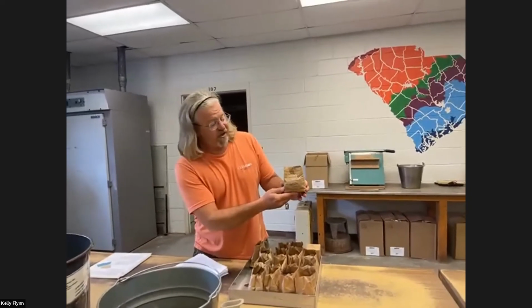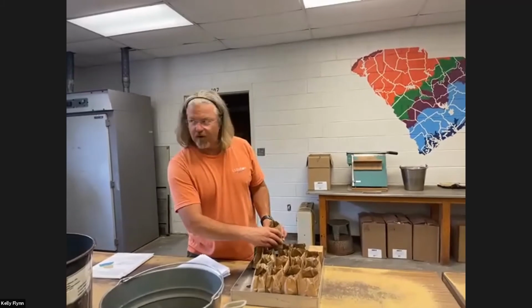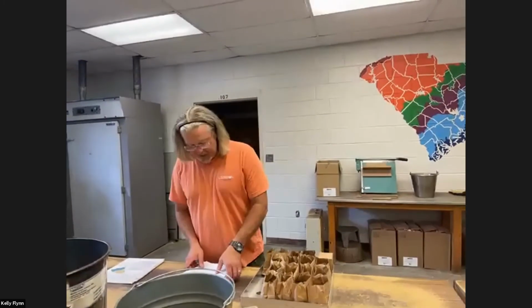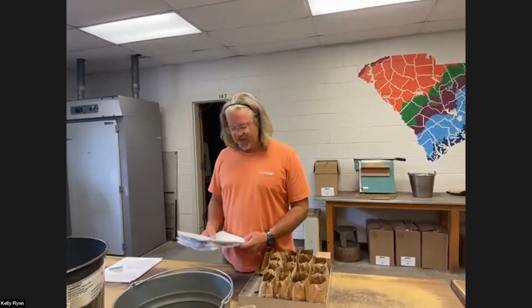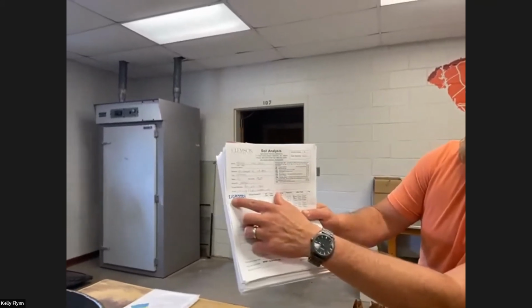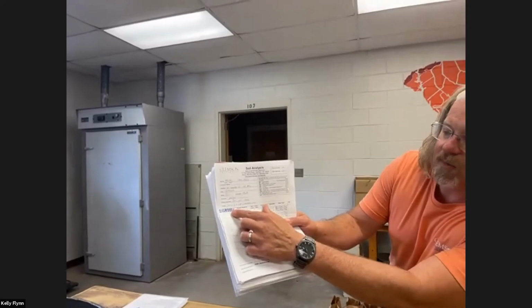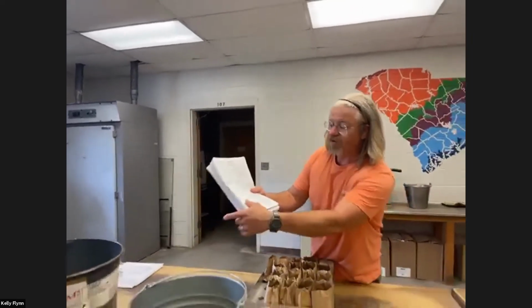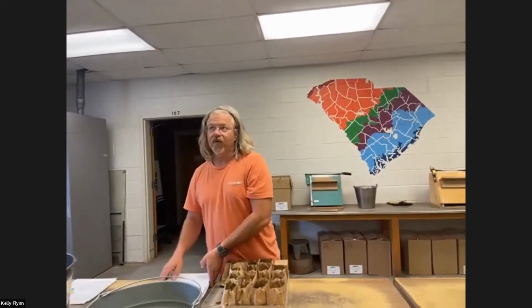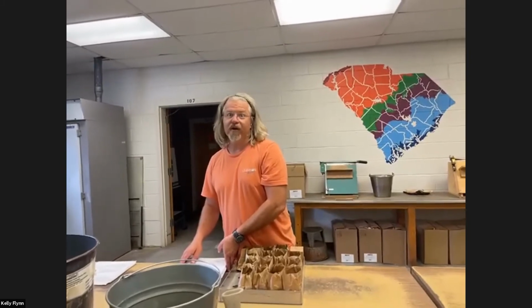There's a fill line right here. If you guys are ever taking soil samples, there's instructions on the back of the bag, but you guys are farmers, I understand, so you'll hear all about how to do that. One of the most important things back here in our sample receiving area is this number. This is a set number. 21 is the year, 08 is August, and then these are the lab numbers, 0001. So we're just now starting August. We have already finished all of our soil that came in during July. That is almost done. It'll be done in an hour or so.